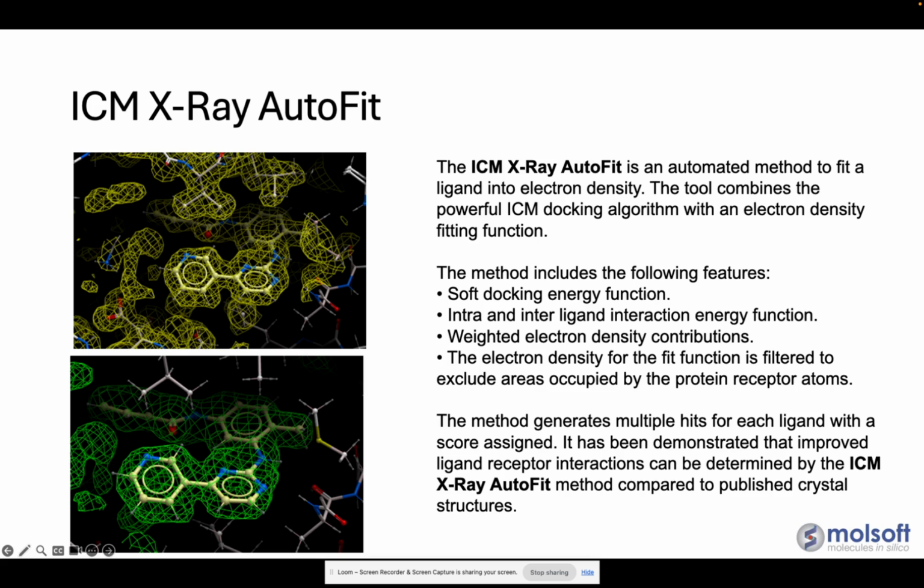There's weighted electron density contributions, so not all parts of the electron density contribute equally to the ligand placement. The method applies a weighting scheme to prioritize high confidence regions of the density, improving the accuracy of the fit.